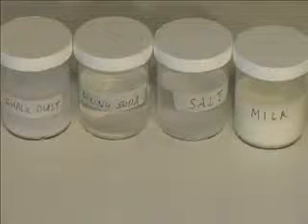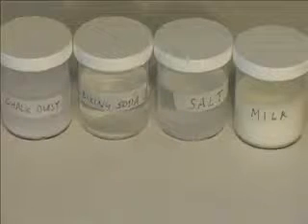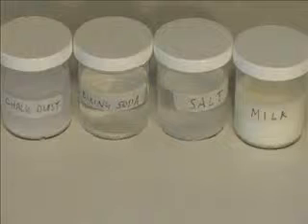Now you're doing part A of the experiment. You're going to test the mixtures to determine if they are suspensions. Let them sit out for about an hour. If solid material settles to the bottom, it is a suspension. Note: if the solids do not settle to the bottom, the suspension may not have had enough time to settle out, and you need to test further.